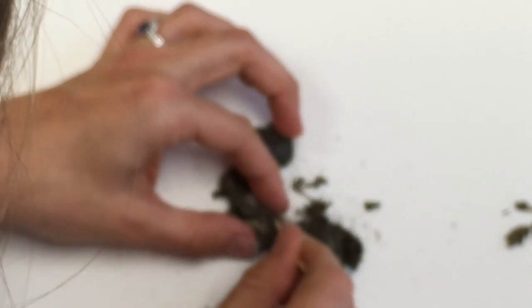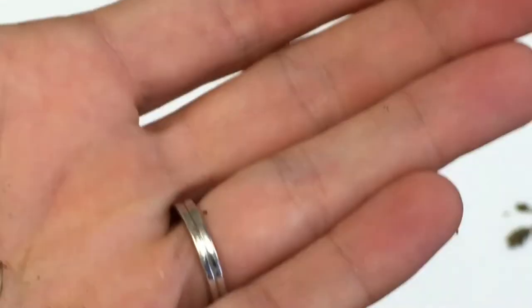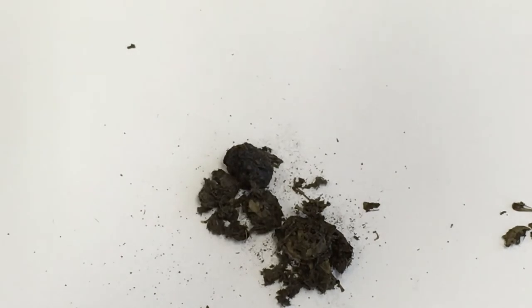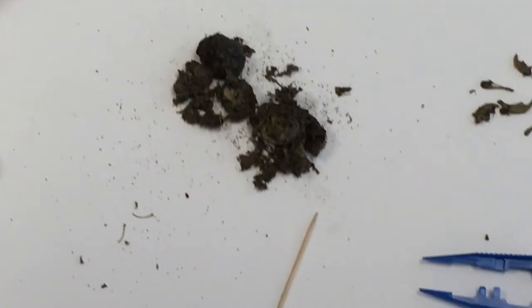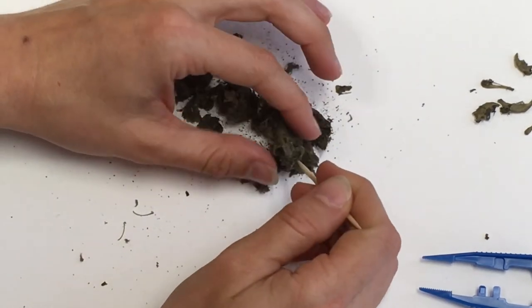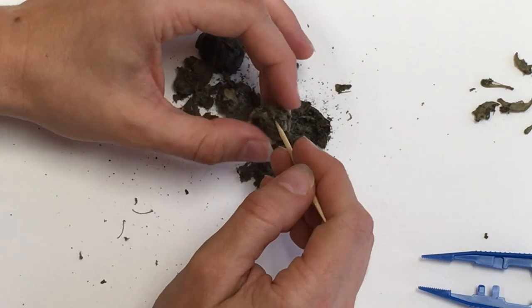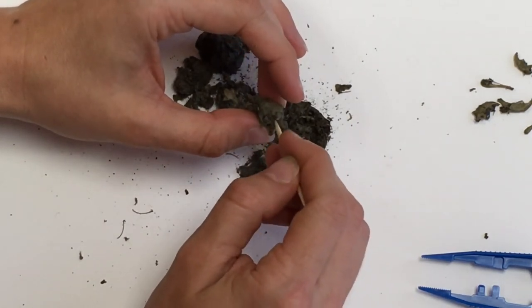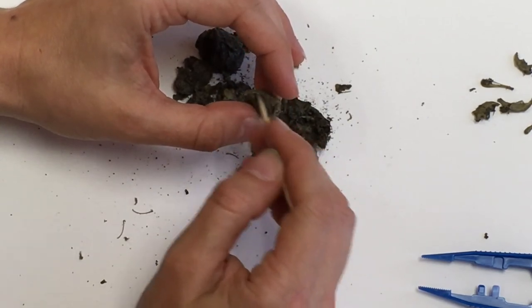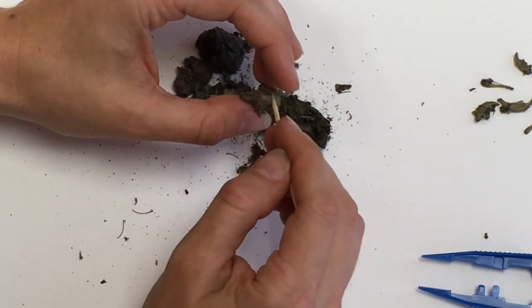It looks like some rib bones in here — they're so teeny tiny they look almost like little pieces of sticks. Let's keep digging around and see what else we can find. Oh, I've got a skull — how cool! So I'm going to carefully get some of this fluff away from the skull, and this looks like it's a mouse skull.